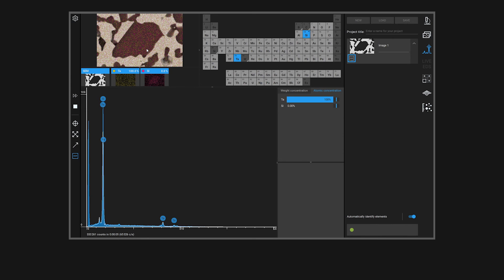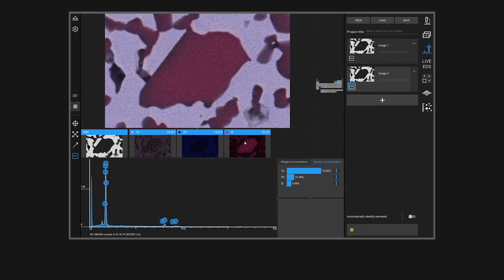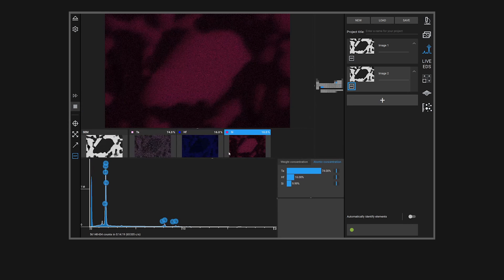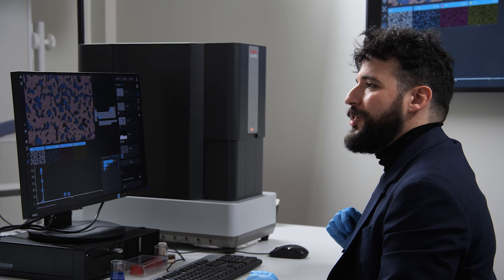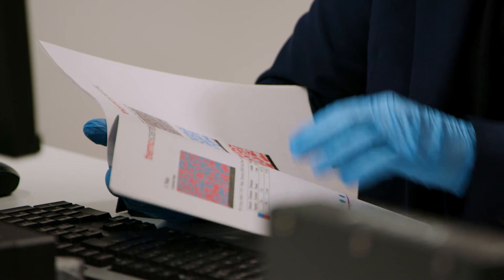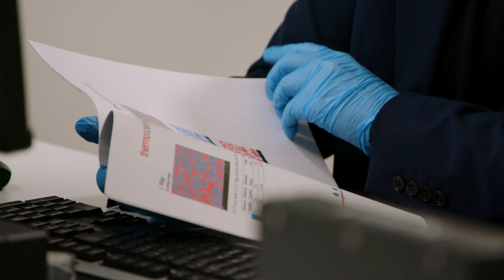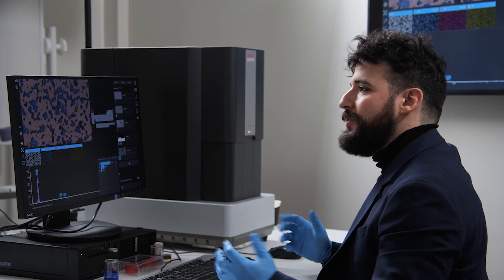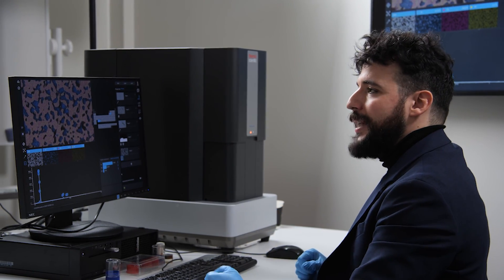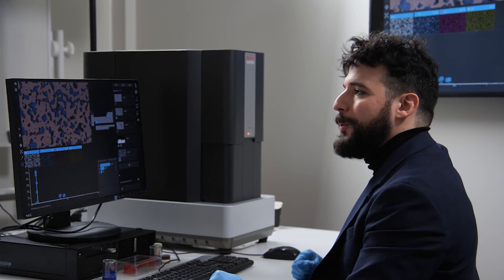The EDS quantification algorithm embedded in the Phenom software can take care of that and provide a quantitative EDS map in a matter of a few seconds. We are now just two clicks away from saving all the information that we have and automatically generating a report which will contain all the information that we viewed in our project.